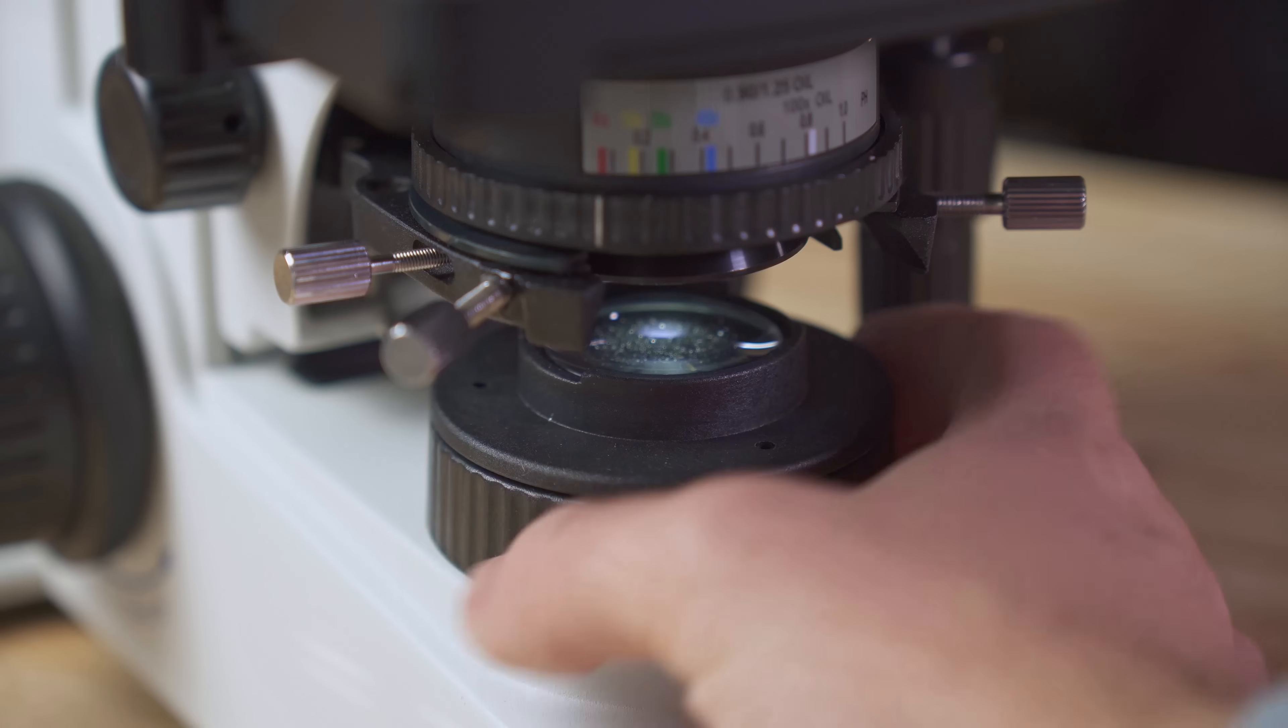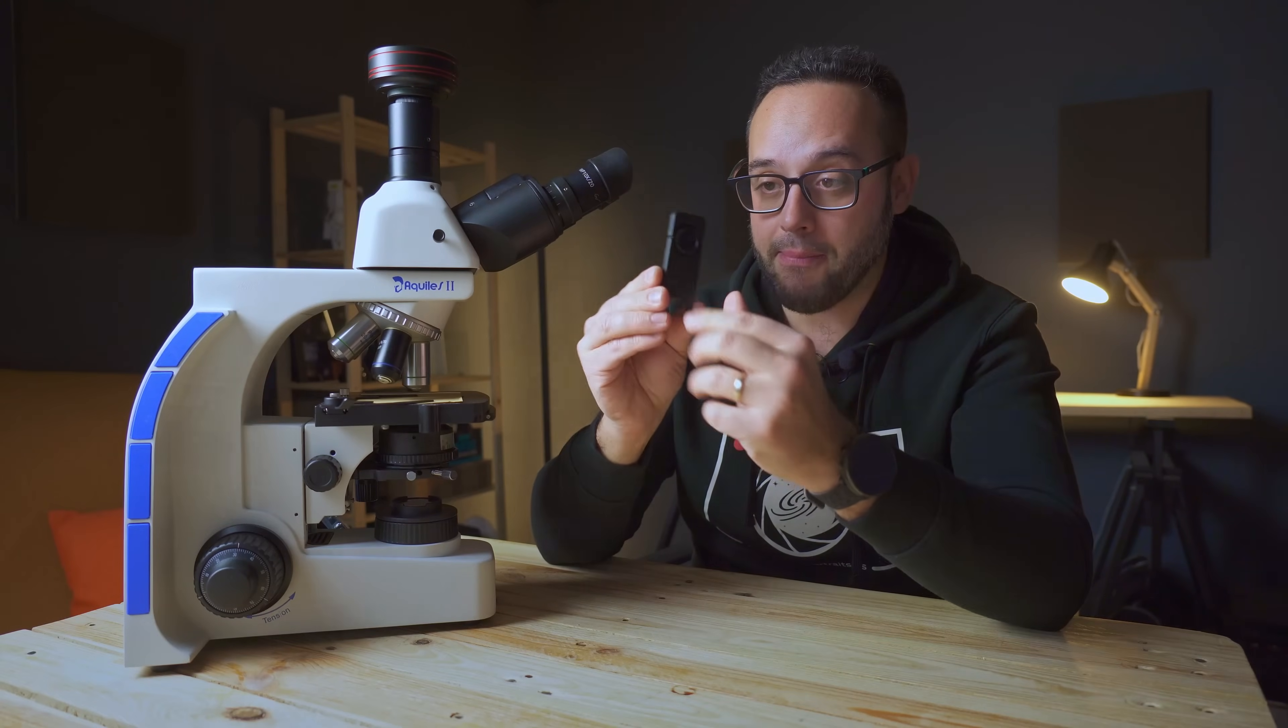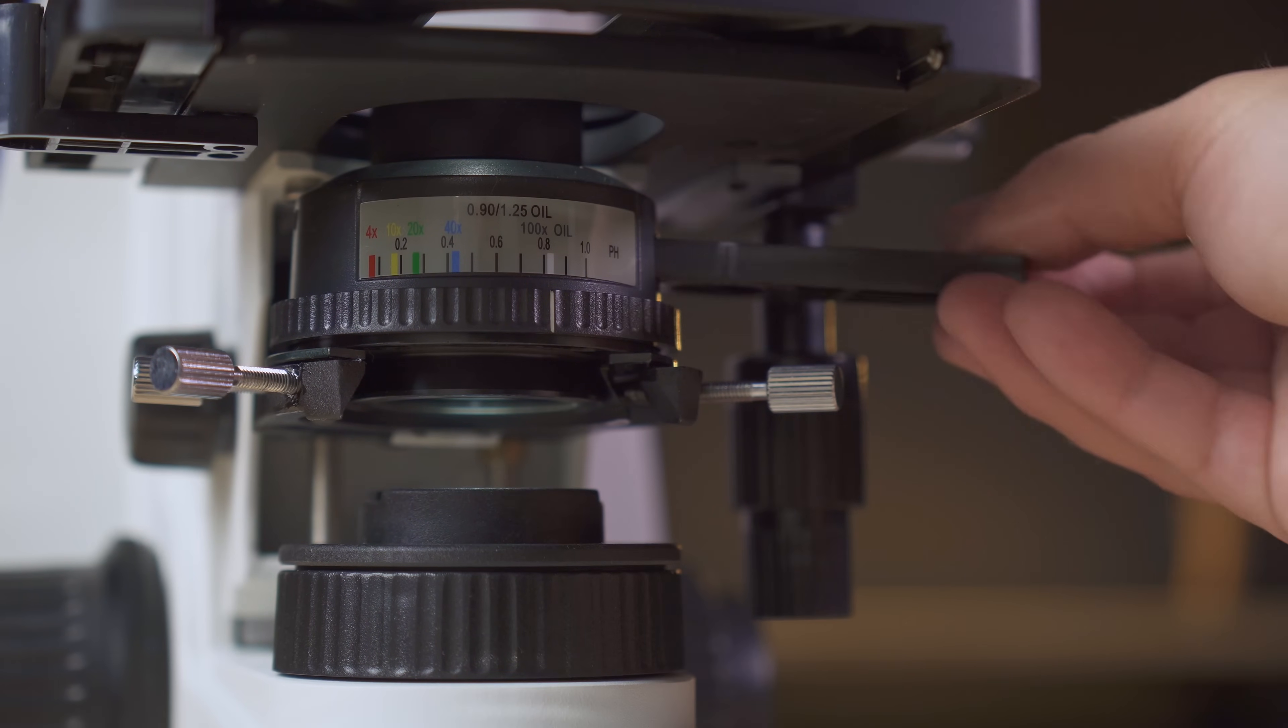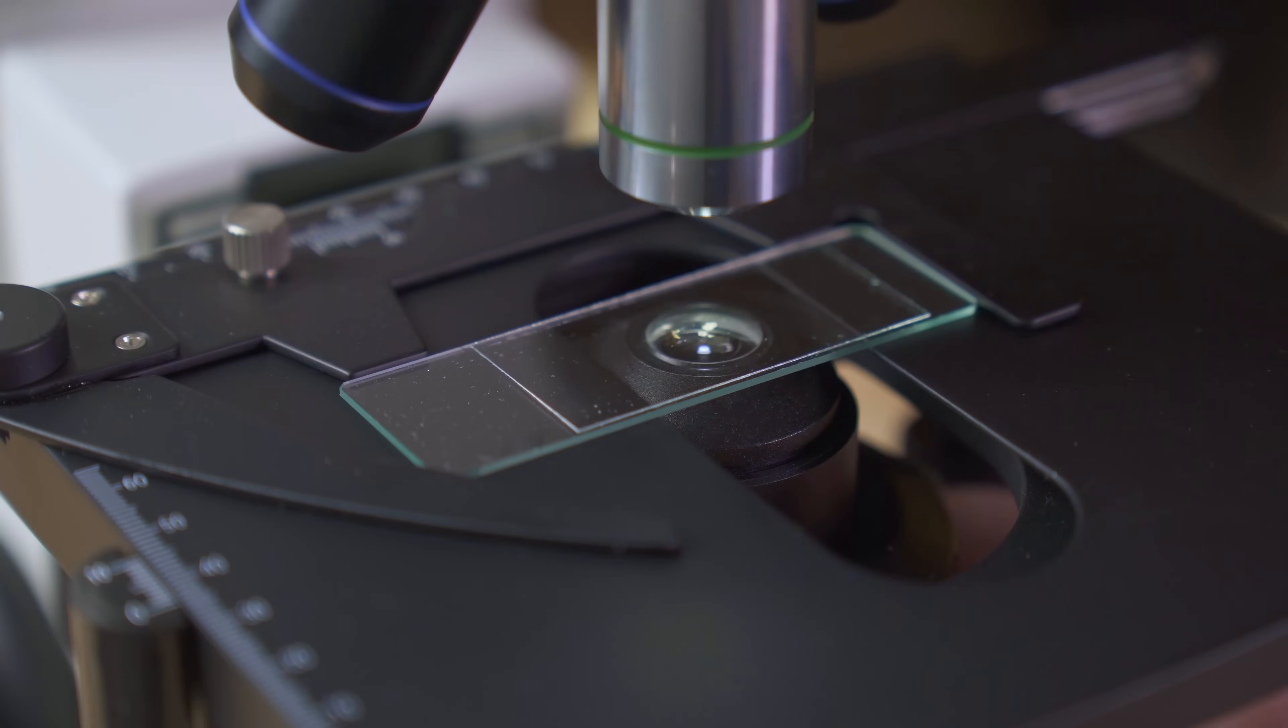And basically we are going to achieve this simply by making the main light of the microscope hit the phase condenser and using these slides that I have here, which basically will allow us to break the light beam and redirect it obliquely to the sample.